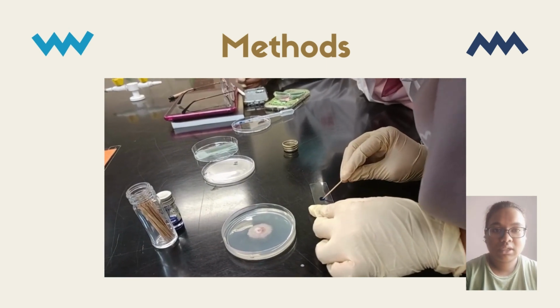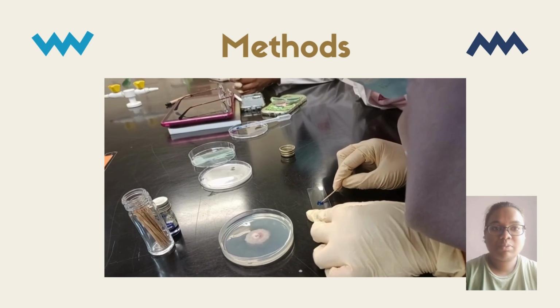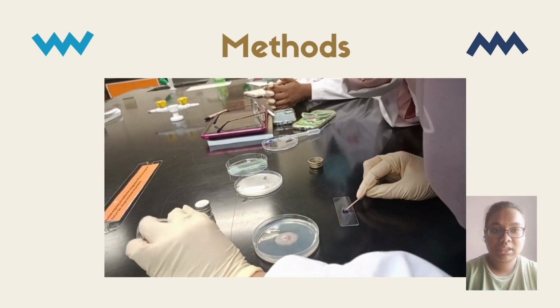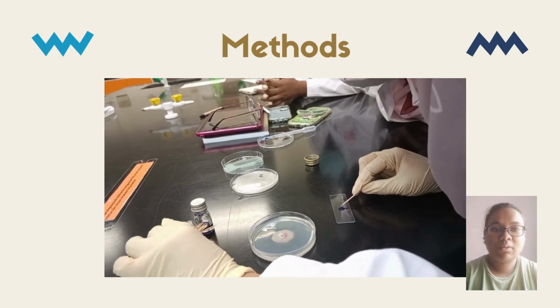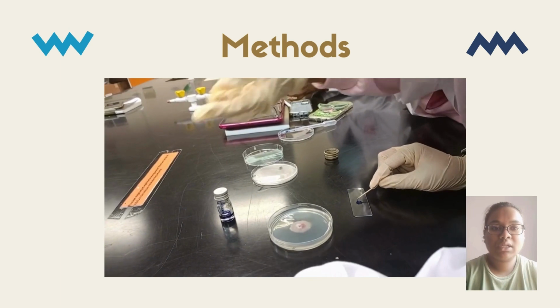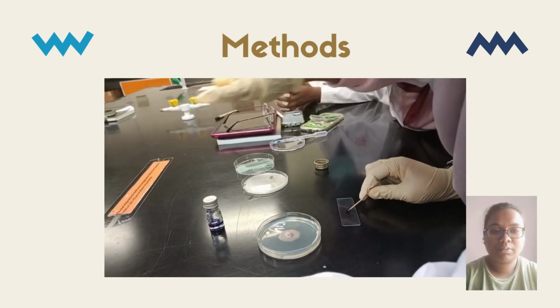For fungal collection, using a sterile needle, pick up a small colony of fungi and spread the mycelium over the LPCB stain on the glass slide. Carefully place a cover slip over the stained fungal material to create a thin layer. Observe the stained fungi under a microscope.